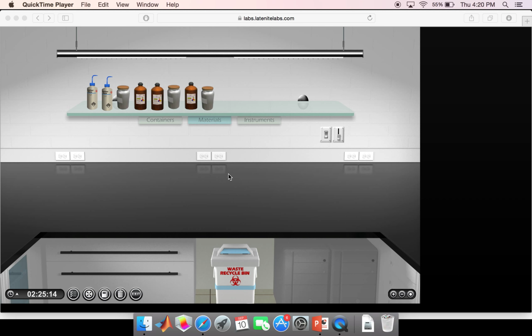Hello everyone, I'm Mike Goldstein, and in this video we will be performing a double displacement reaction in the online software called Late Night Labs that you will be using throughout your course.